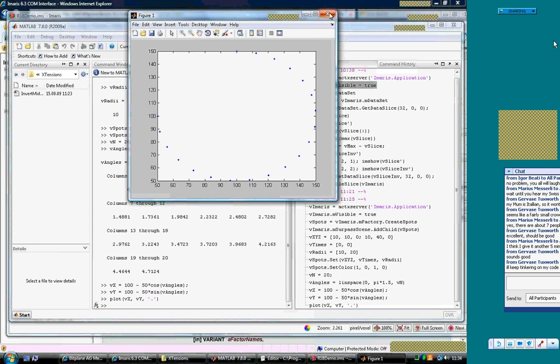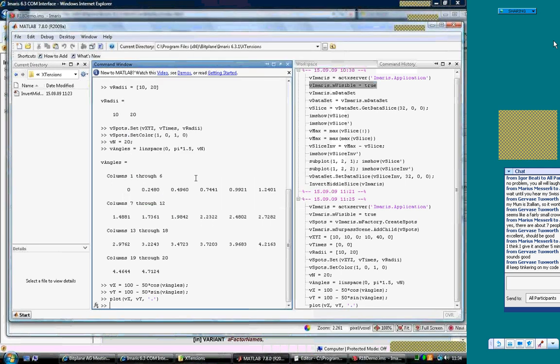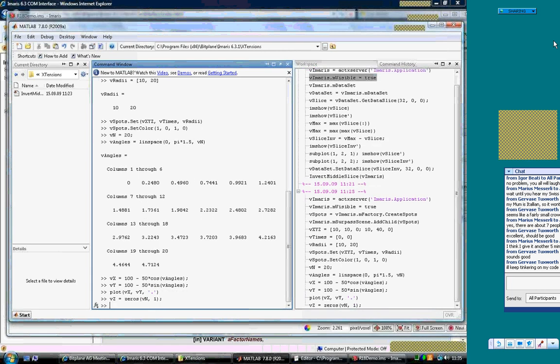Now we can have a constant z. We want to have it to n values, a vector of that size, and all filled by zeros. This way. And now we want to have the time points be 0 themselves as well.